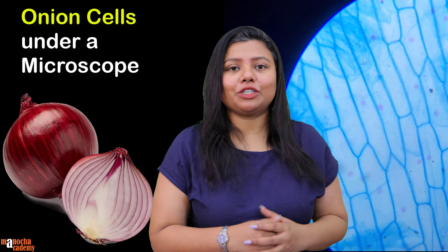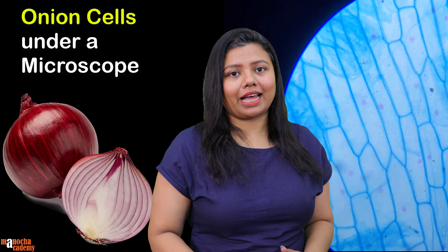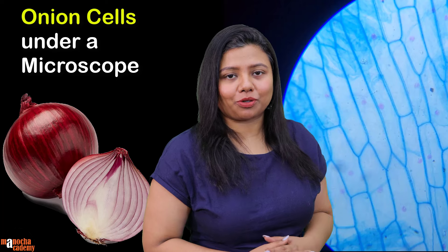I'm sure you have all seen and eaten an onion, but have you ever wondered what the cells of an onion look like? In this video we are going to do exactly that. We are going to prepare a slide of an onion peel and observe it under a compound microscope.